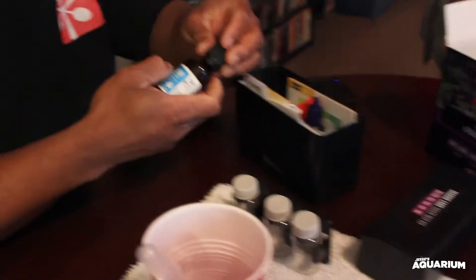Alright, we'll set that to the side. Make sure you remember that was 11. Next test we have to do is the nitrate test.